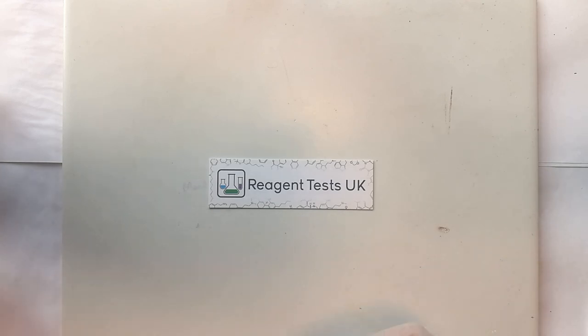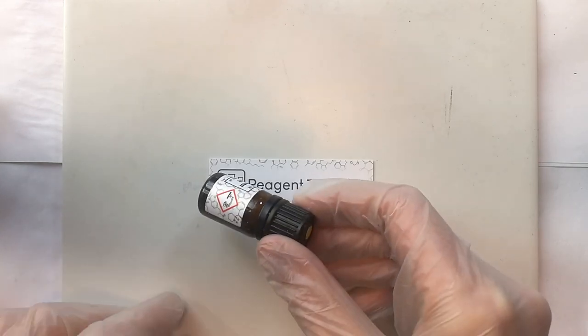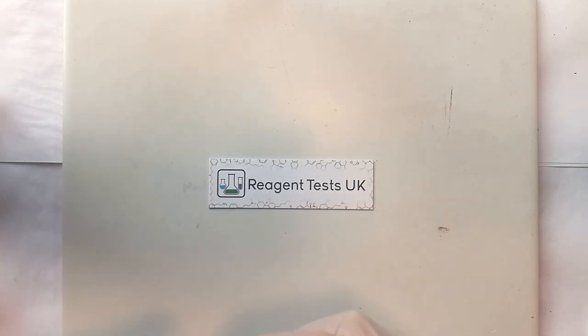The first thing to consider is the safety considerations. Reagent tests are corrosive and that means that we do need to take some care and some precautions when using them. If they get onto your skin and they're left on for a few minutes then they will cause minor chemical burns. If they do get on your skin then they need to be rinsed off with fresh water in a prompt and calm way. There's no need to panic but it's something that you shouldn't wait to do.